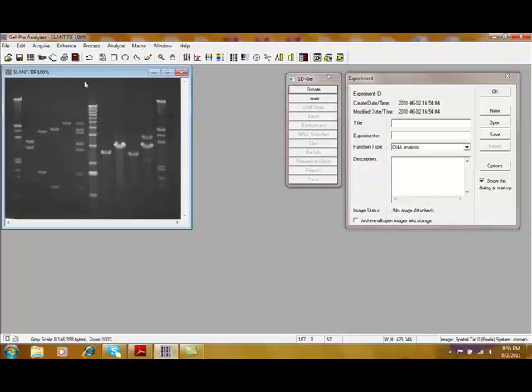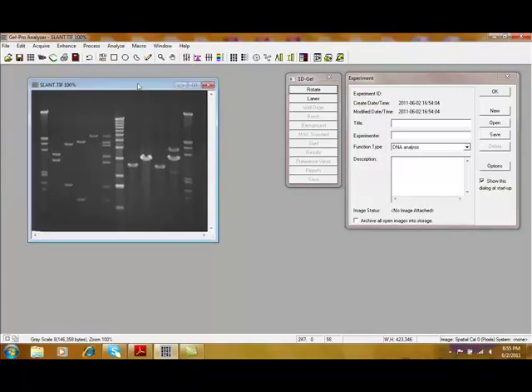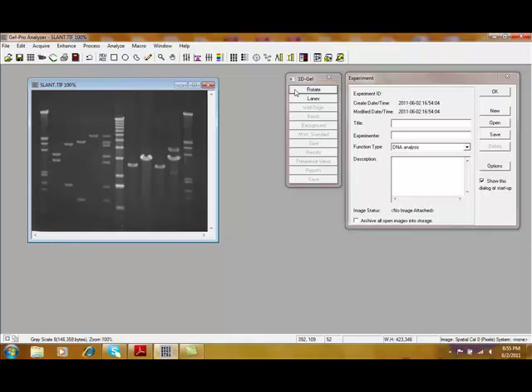It also has some issues with it that we will correct, which is very easy to do in GelPro Analyzer. So, the first step, if you have any type of rotation in the image, you can correct for that by selecting the Rotate button. In this case, the image is fairly uniform. We'll go right into Automatic Lane Detection.